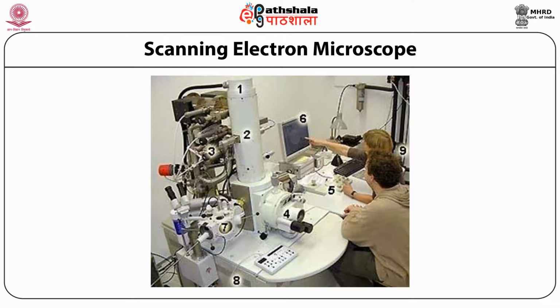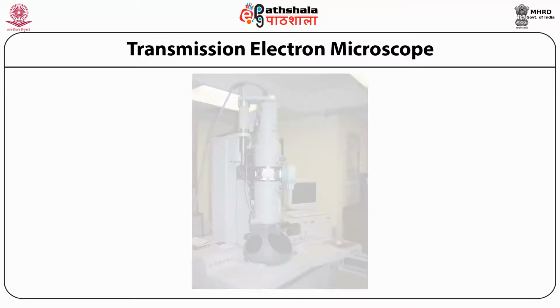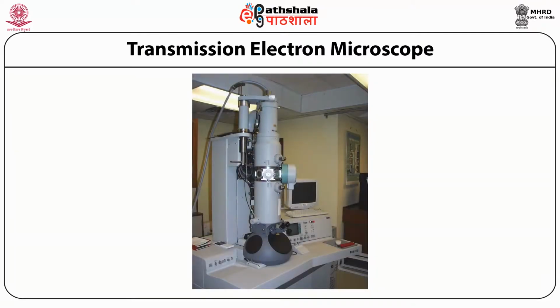7 is the cryo unit to prepare, break, coat, and sublimate frozen material before insertion in the observation chamber in cryo SEM mode. 8 is the electronics stored in cupboards under the desk. The image here shows a working transmission electron microscope setup present in a lab.